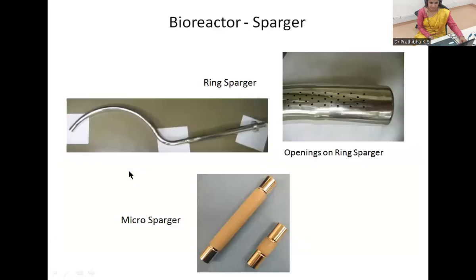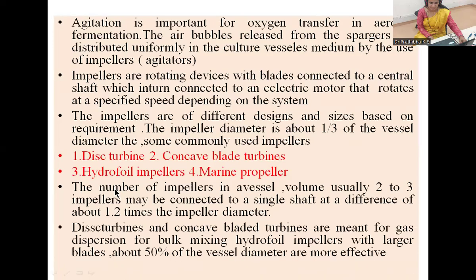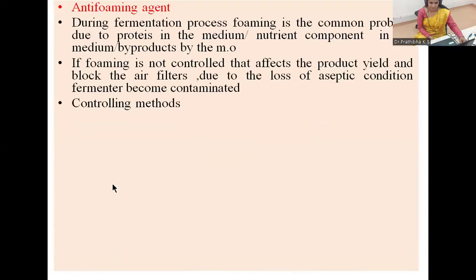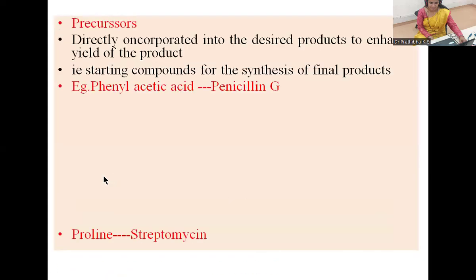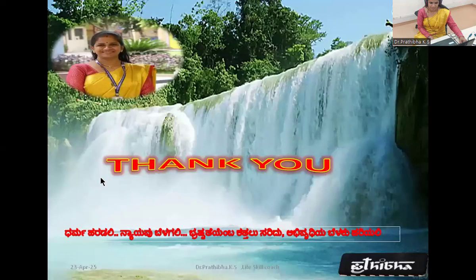I hope I made aeration, agitation, and the baffles crystal clear. If you have any doubts, you can reach out to me and clarify them. All these you need to keep in mind for the examination, and start studying. You can make notes also. That will be very useful.